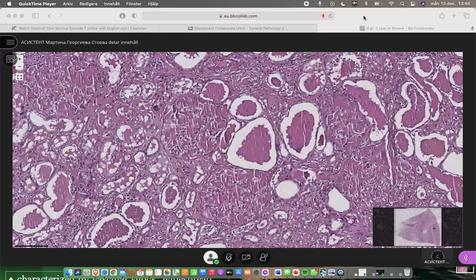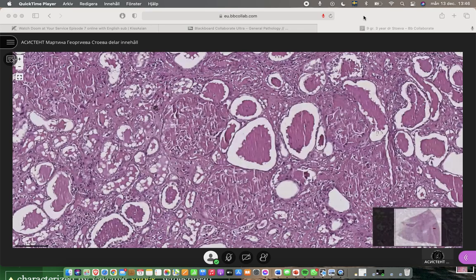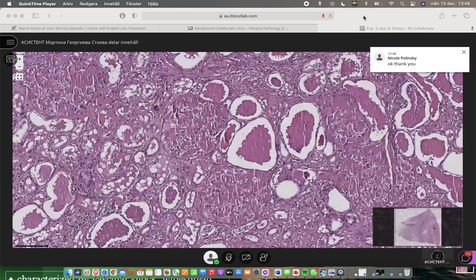Yeah, but the preserved glomeruli, which are not affected by hyalinization, are a little bit hypertrophic to compensate the lost function. But the hyalinized glomeruli themselves are decreased in size. I asked 2 people. They said, while the glomeruli that are affected by amyloidosis, they are enlarged. So here we compare the affected glomeruli.